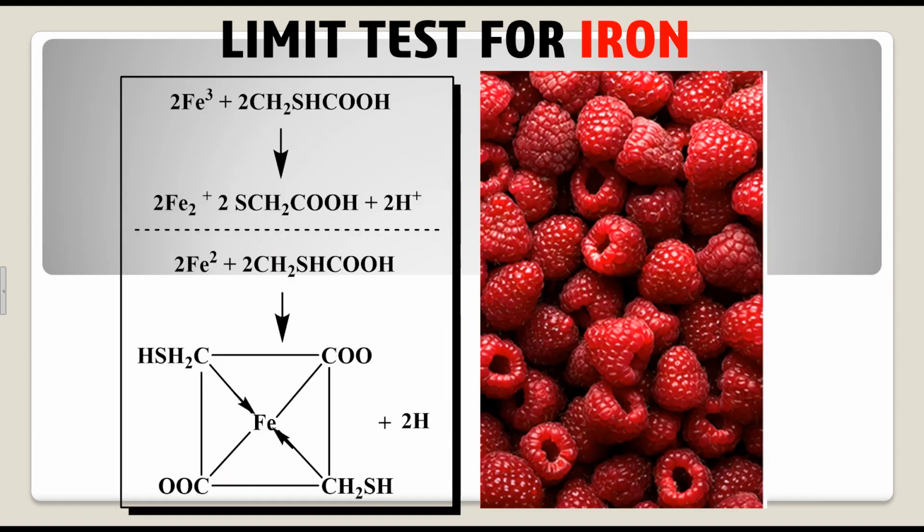You can see the reaction. This is the reaction. That iron reacts with thioglycolic acid. You can see the complex now. Iron thioglycolate. This is the end color, it looks like.